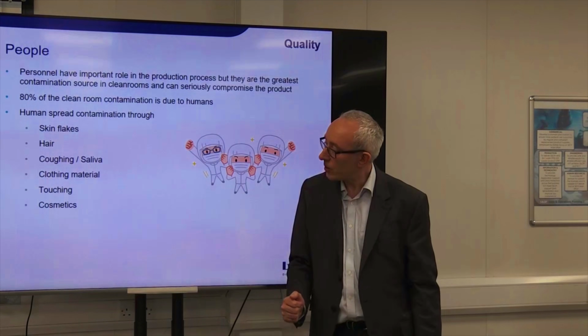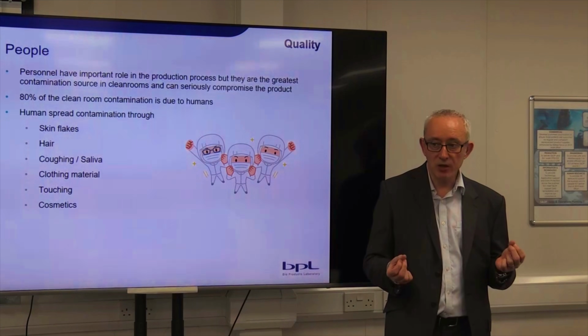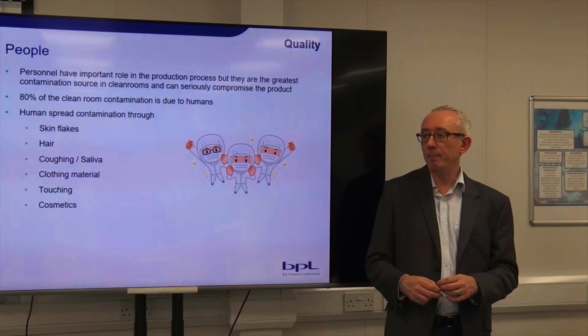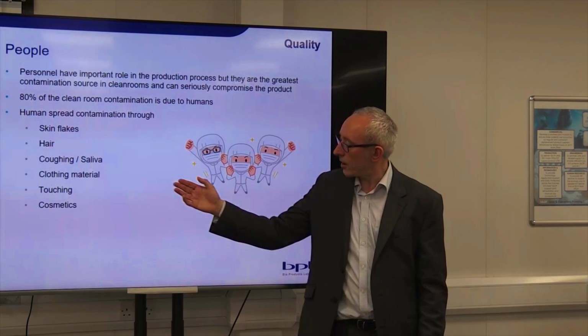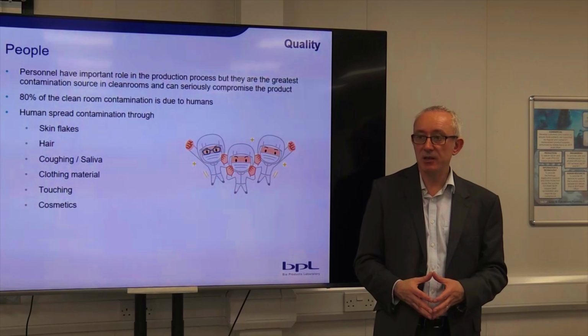Another thing is cosmetics, and cosmetics are a big source of contamination. They can produce thousands of particles. So to go into a clean room, it's not permitted to wear any cosmetics whatsoever.